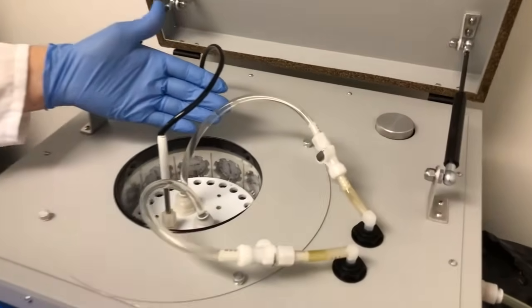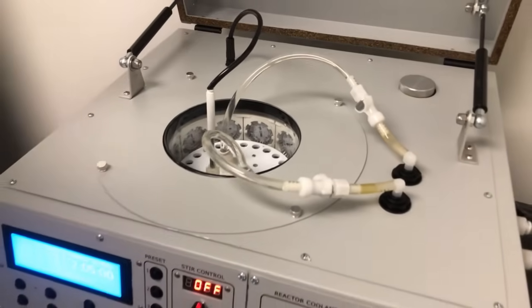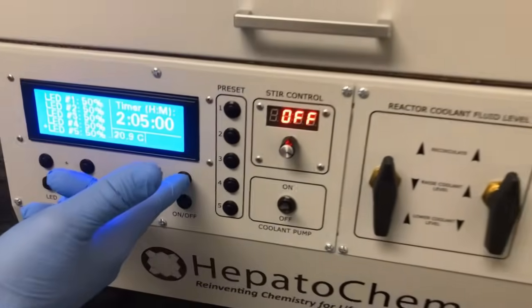Then we use the quick connects to connect the inlet and outlet of the thermostatic fluid. As you turn on the pump, water will start to circulate. At this point, simply close the Lucent360 and start the timer for the reaction. Then turn on the light modules and everything has started.